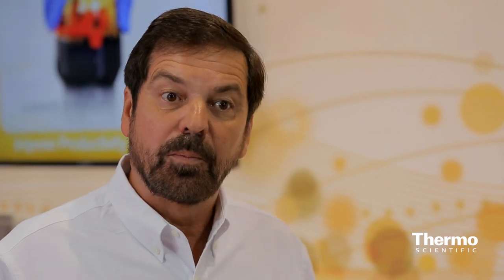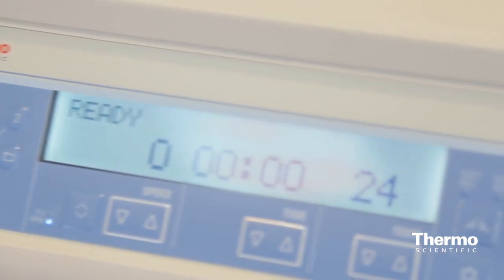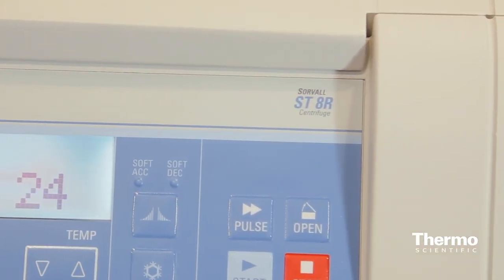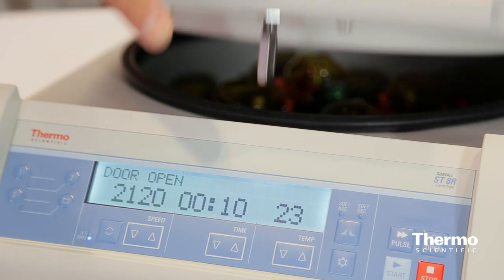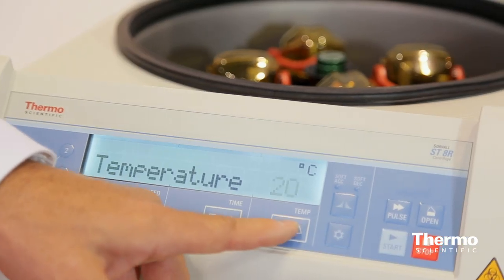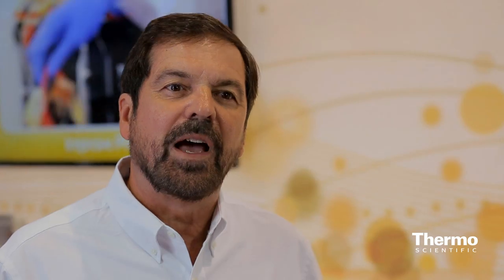The other features we've employed in this new product make it easy to use. We have an easy-to-see display — a clinical lab is a strong work environment and you really want to know when the product is running and when it's done; you can see the display across the room. It's also easy to program because in a clinical lab you'll often be running the same protocols, so you don't want to have to reprogram every time.